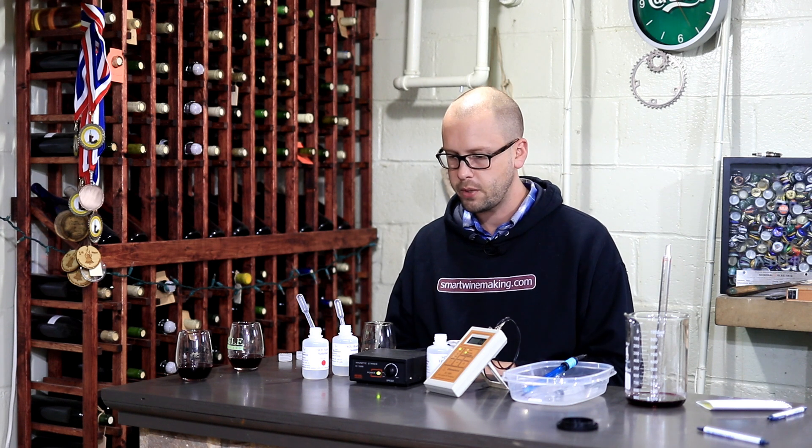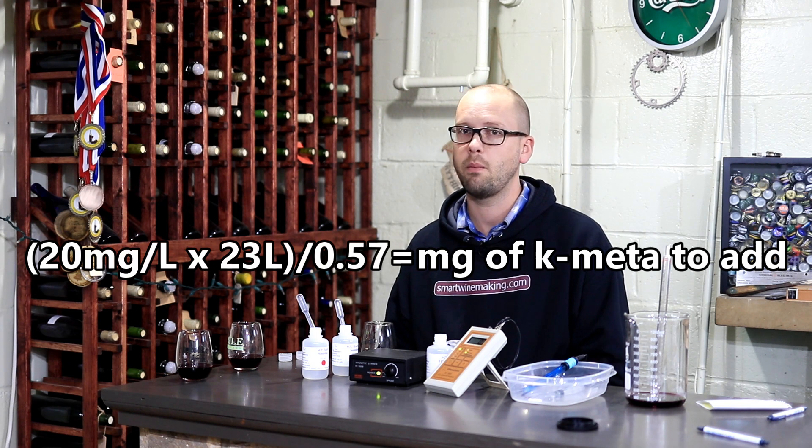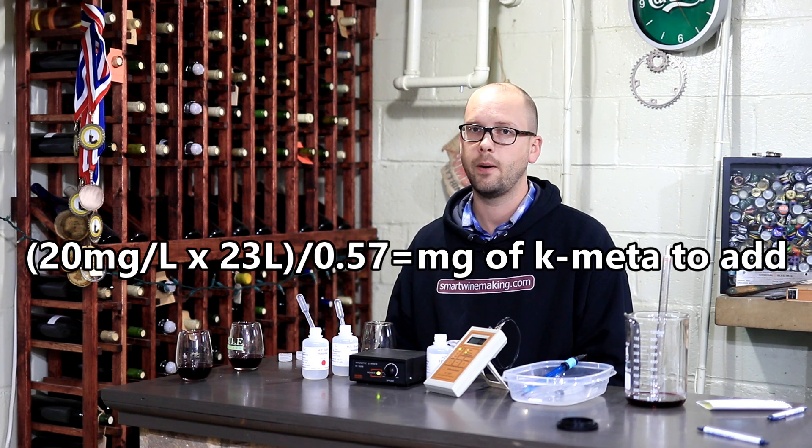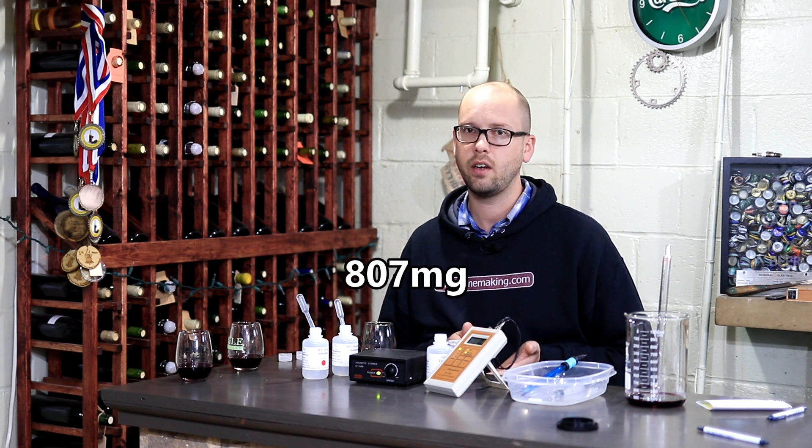I'm adding it in the form of potassium metabisulfite, which is probably what most of you are going to be doing also. Potassium metabisulfite contributes about 57% by weight to free SO2. So I'll take 20 times 23 divided by 0.57, and that gives me the amount of potassium metabisulfite to add — about just under a gram, probably about 800 milligrams. Make sure you don't add 800 grams — that would be insane.